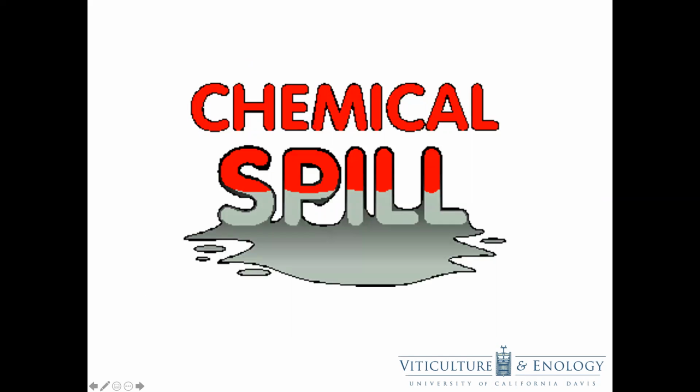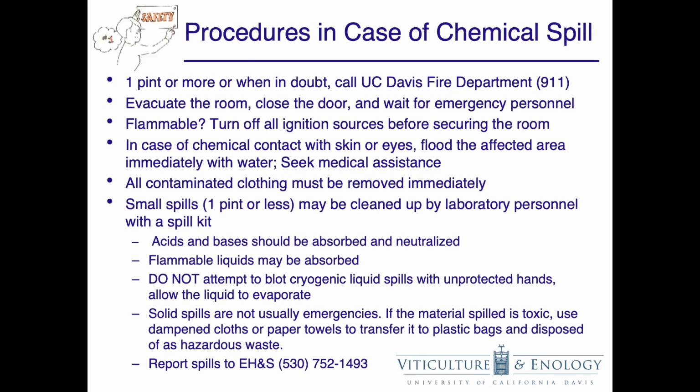So let's focus on one of the most common lab accidents, the chemical spill. In the event of a chemical spill, follow these procedures. If 1 pint or more is spilled, or if you're not comfortable cleaning up the spill, call the UC Davis Fire Department or 911 from a landline. Evacuate the room, close the door, and wait for emergency personnel.